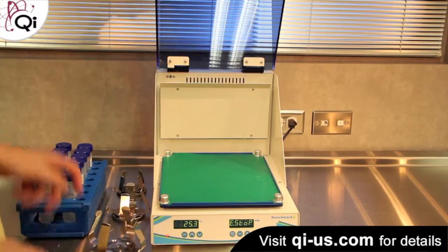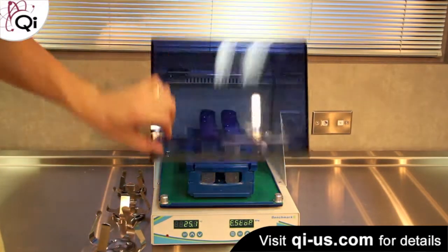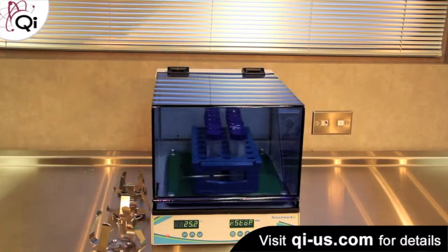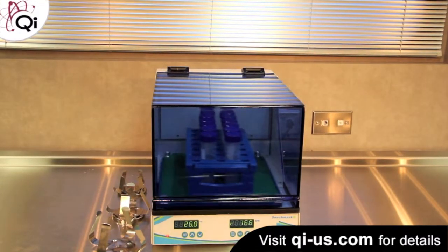With the flexibility of the Magic Clamp system you can quickly switch between different flask sizes, you can mix and match, you can put pretty much whatever you want on the platform very quickly and very easily.